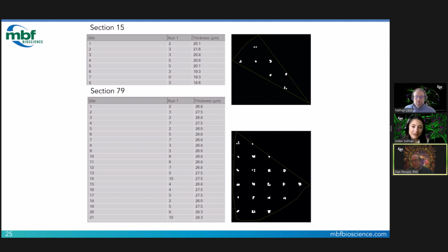That's right. If you had a bunch more 18 micron thicknesses and 19s in there, then you would realize, oh, I need to make my dissector 18, not 20. But even if you brought it down to 18, then you would put up with a couple 17s, if you know what I mean. Yeah, I'll keep that in mind as we look at the Z extent in my other sections and use that information to select our guard zones.